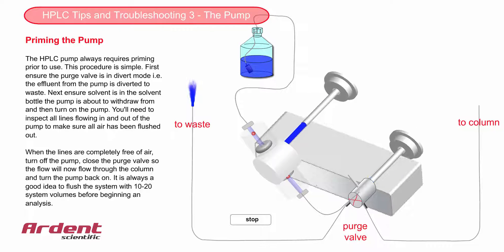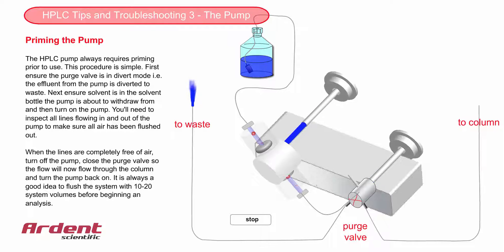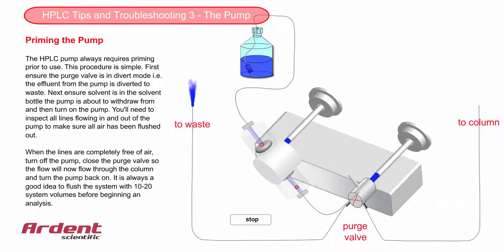At the start of every day before using your HPLC, you will need to prime the pump. First of all, make sure that the purge valve is directing the flow to waste, and then ensure that there is enough solvent in the solvent bottle and the solvent filter is immersed in the solvent.